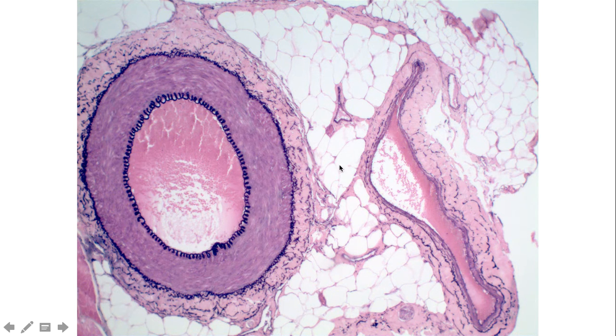And so the other type of vessel that we're having you look at in lab are going to be the veins. And so again, going here to the right, we can see a vein. And as I mentioned, veins often have this collapsed lumen. And as I said at the very beginning, they also should have a relatively thick tunica externa relative to their tunica media, right? And so the relative size of the media versus the externa can often be used as a nice characteristic to define if we're looking at an artery or a vein.